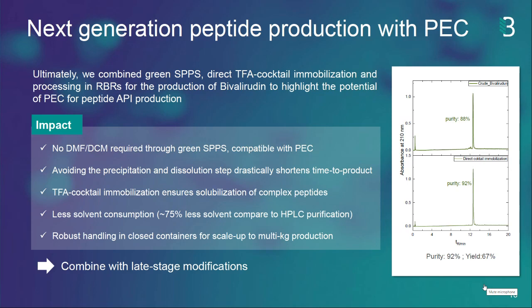Onkar asks, please elaborate on capture resin details. Is it required to pack them in a column? No, there is basically no column required. If I understood the question correctly, it is where the activated filter material is held. You can have it in everything you want. You can even have a round bottom flask and a mechanical stirrer, or you could just add it to a cartridge that holds any type of container where you can shake or rotate, for example in an SPPS reactor, or as shown by Manoj, in this SpinChem reactor. So there is no specific column or anything that you need.